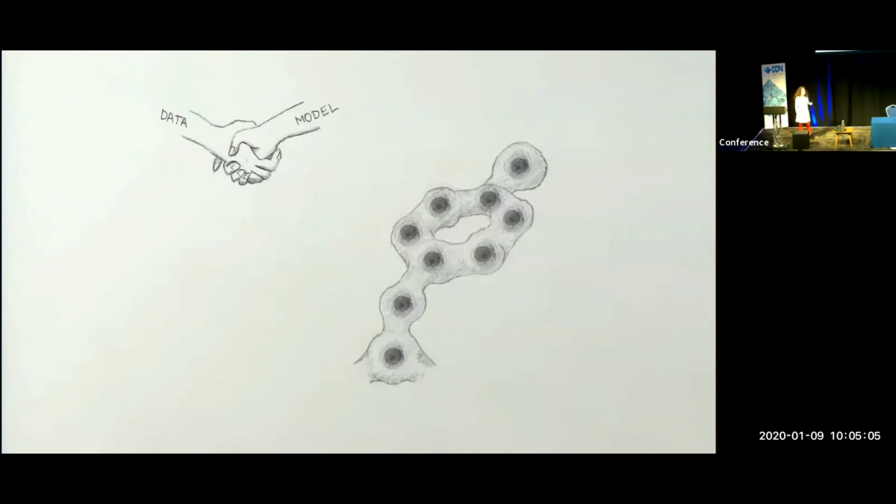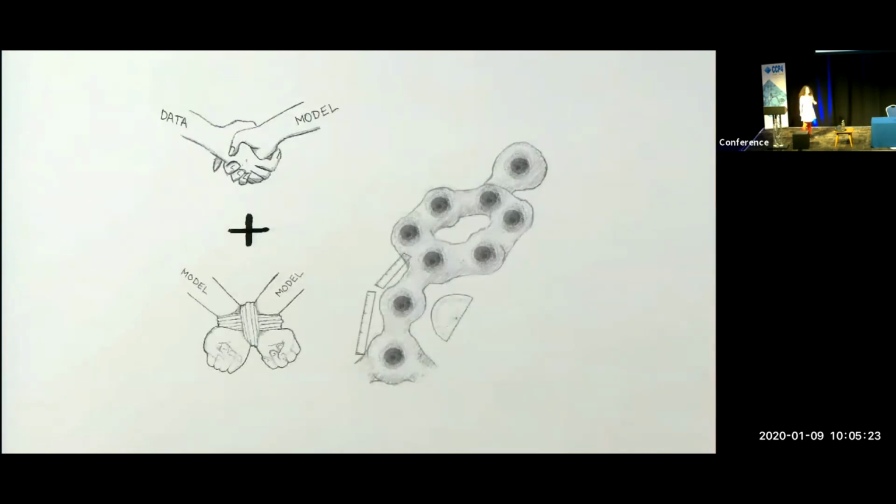One half is the agreement between the data and the model, and that drives your model towards the correct solution. But to keep it stable, there's an additional component of restraints which are applied to the model alone, and that includes things such as bond lengths and bond angles, which we know very well and have been empirically derived and are present in the literature.